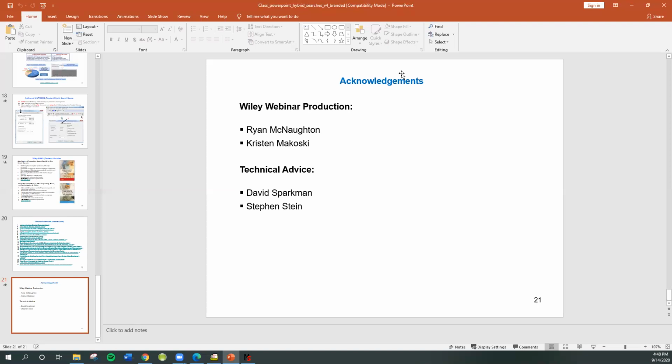So that makes sense. I just really want to tell you that it does look easy. You can push the button and get the results, but customers realize after a while, if you're giving them bad results, then they'll lose confidence in you. So make sure that you can keep the confidence of your customers by working together as a team.